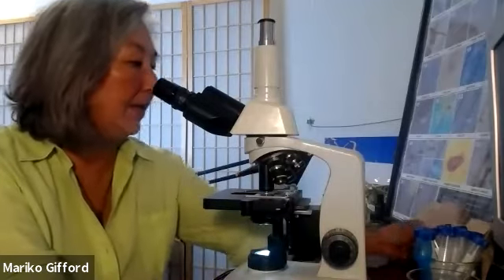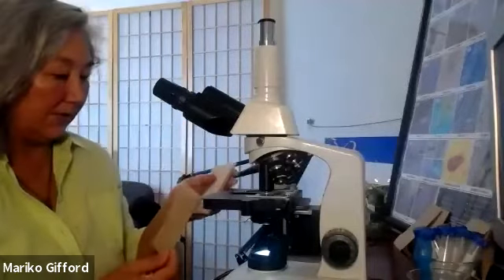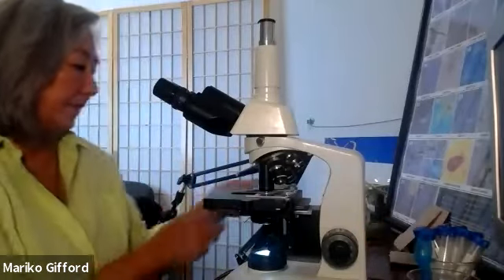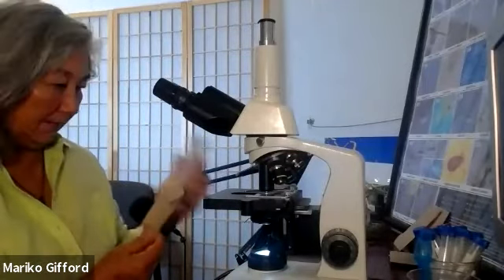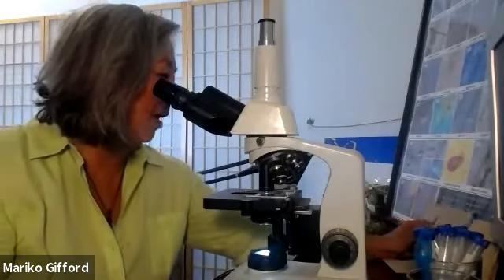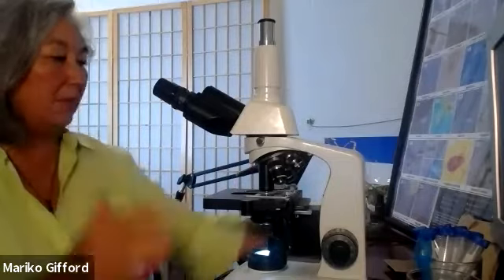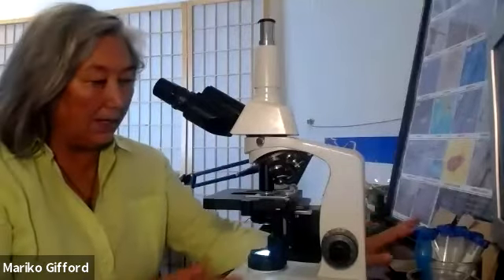I have all of these little packets that I've labeled with different sources. This is compost. This is compost from the soil from the base of a moringa tree. This one is from the worm bin. This is from somebody's specific worm bin. And this is soil beneath the pots. This is a mushroom beneath the moringa tree. And this is soil on top of black plastic that was covering a certain area. So I have all these labeled.